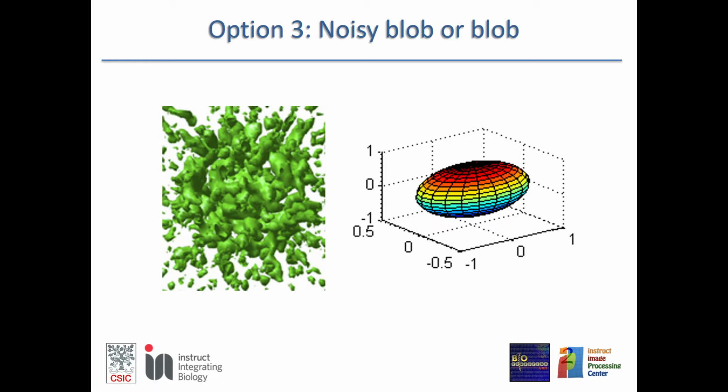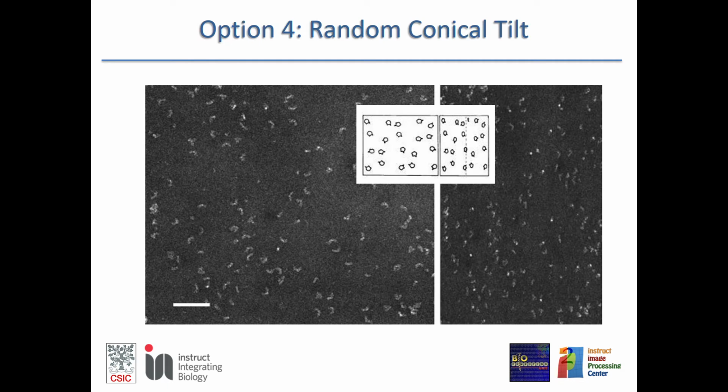But these optimization algorithms are normally too greedy. So sometimes they can go away from the initial point, but other times they cannot escape from there and they can never find the global minimum. So these strategies sometimes work, sometimes they don't.